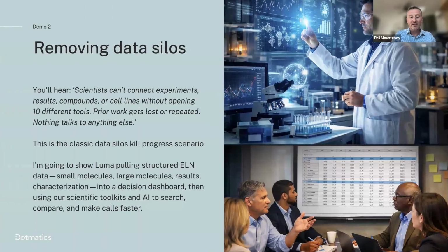Okay, so we can remove data silos. I talked to you how we can use AI to make sense of the data in our apps. I talked to you about how we can use AI to help us build these apps. Once we have an app, we can build these rich dashboards, which I showed you. And then in the first demo, we can actually share those rich dashboards back with our notebook to help bridge the gap between the connectivity that Luma has and some of the data that you're inputting in your notebook.